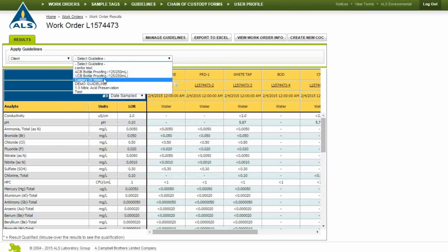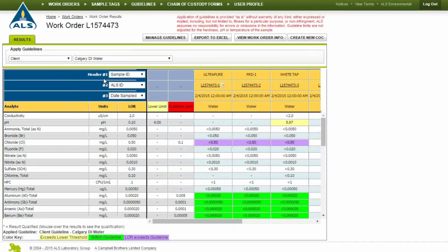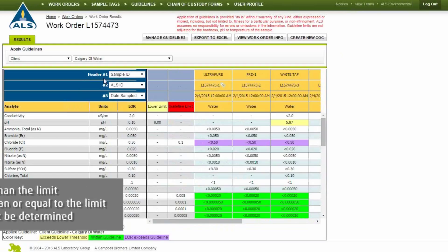When the guidelines have been applied, all results that have limits will be tested to see whether they are greater than the limit, shown in red, less than or equal to the limit, shown in green, or cannot be determined, shown in purple.